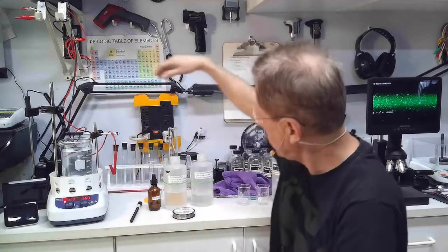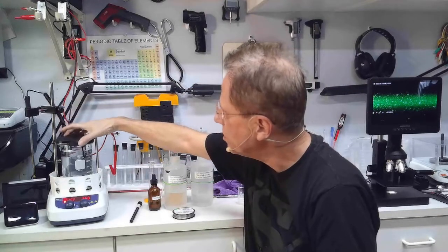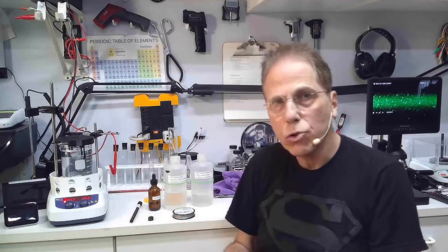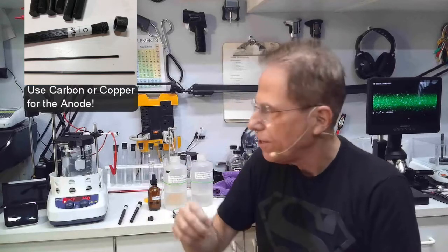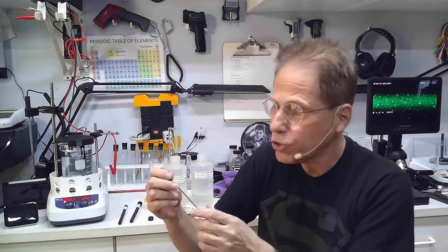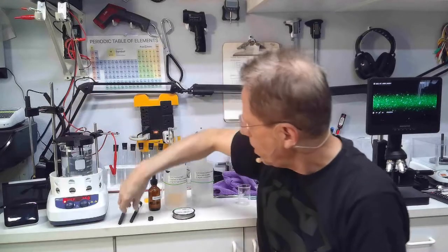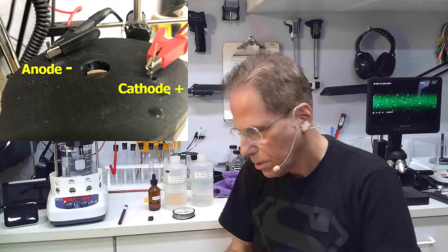There's an anode and a cathode. I use a carbon rod for the anode. The anode never loses material — it pulls the material off the other rod and draws it into the solution. The carbon rod goes in on the anode side, and the cathode side, which is the positive of the power supply, is going to get titanium.